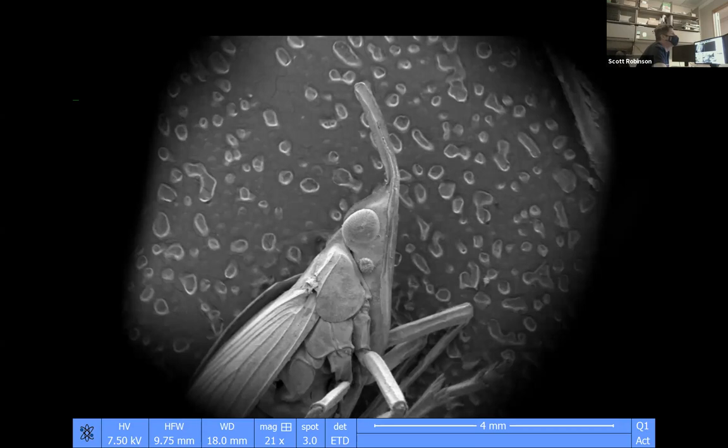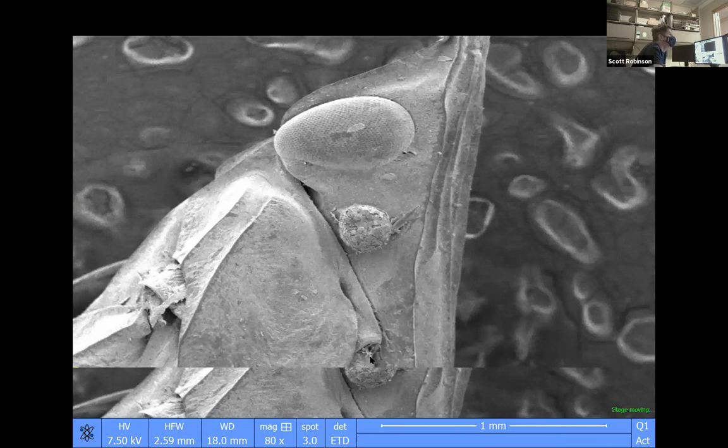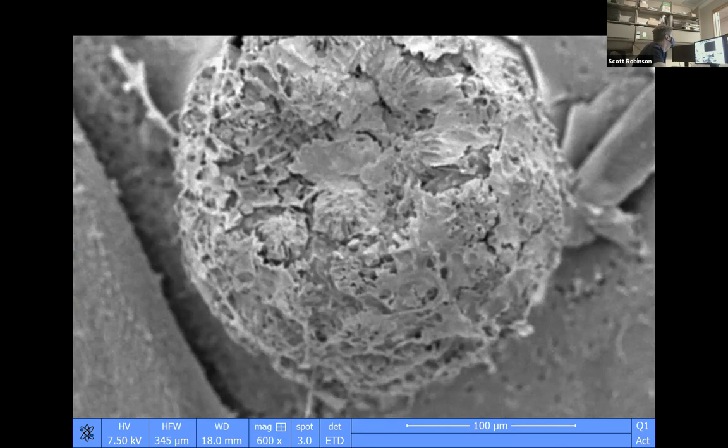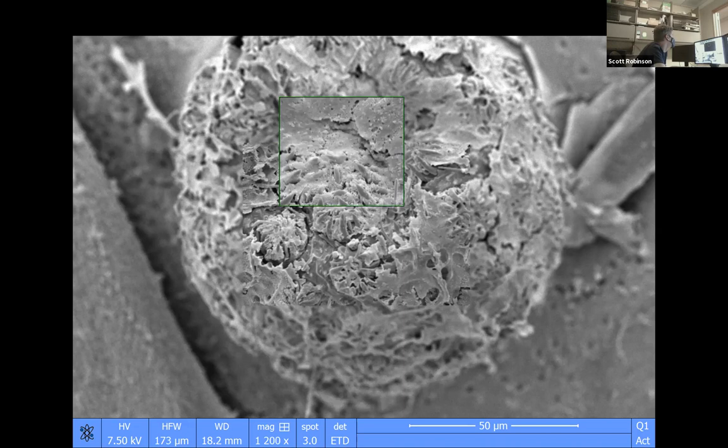Yeah, weevils have what's called geniculate antennae, which means their antennae are elbowed. Those would come out. And the horn on this one might just be an ornamental structure that helps with camouflage. I don't know if it has a functional purpose besides that. With weevils, their snout is their mouth part that's been extended, almost like a rostrum, but they don't have piercing, sucking mouth parts. They just have chewing mouth parts. They have a very long face, and it's at the very end that they use to chew.